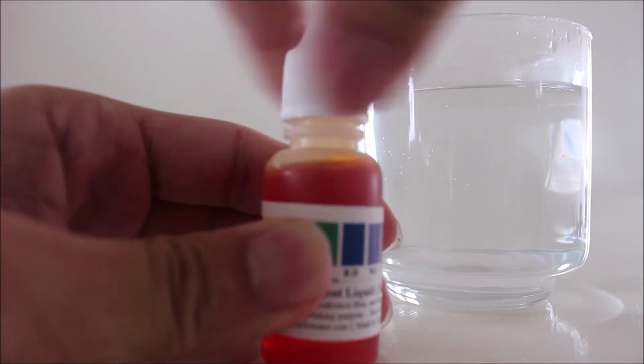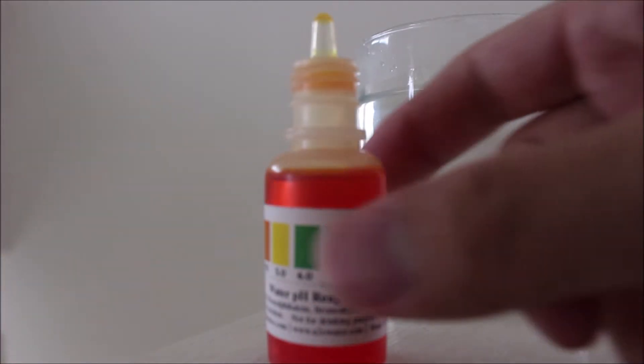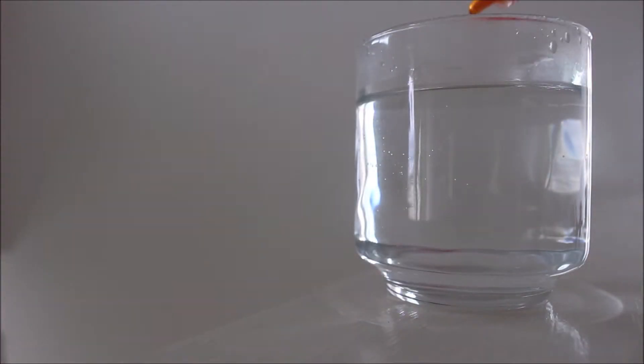So here, let's do the test. Open this up and I'll put about 3 drops in. Maybe a bit more.